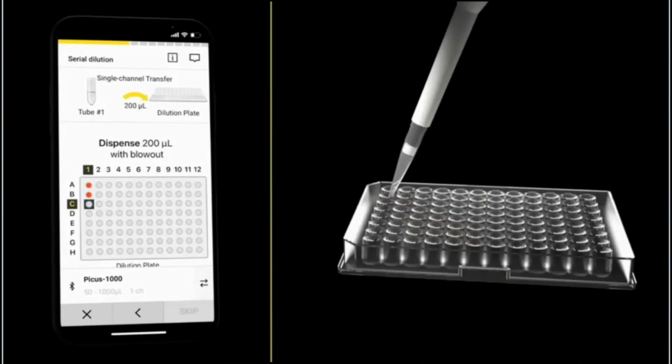So connected electronic pipettes open up a whole new dimension of traceability and user guidance for sample prep workflows and pipetting protocols. With the newest electronic pipettes on the market, you're able to make workflows, for instance, in a mobile application, which then automatically selects the most optimal pipettes for the workflow from those that you have available, and sends the pipetting settings, the volume, speed, and mode, to the connected pipette via Bluetooth. It also automatically does the switch between the different pipettes depending on the step in the workflow. Additionally, it gives a graphical overview of each step in the workflow. All these features are particularly helpful when working with long and very tedious workflows.